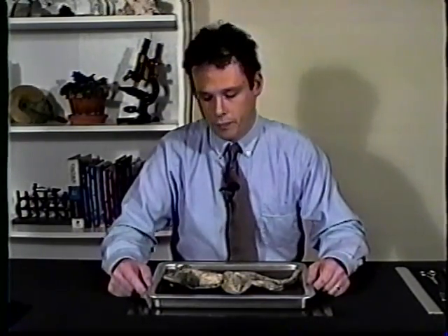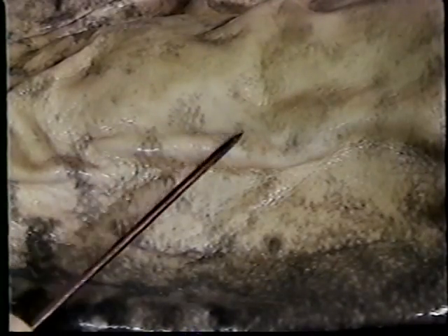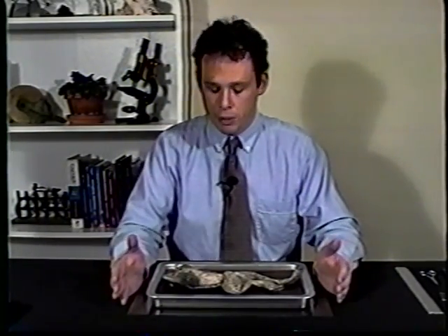First, let's take a look at our specimen's skin. We find the skin to be loose and moist, very similar to the way the skin would appear in the frog's natural environment. As we look closer, we can see very fine blood vessels running just beneath the skin's surface. A frog partly breathes through its blood vessels located near its skin, and this is a very good reason why they're mostly found living near wet and moist places.